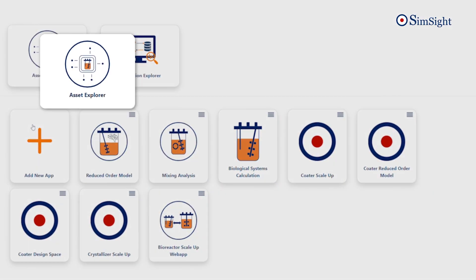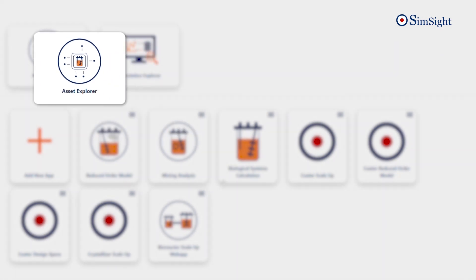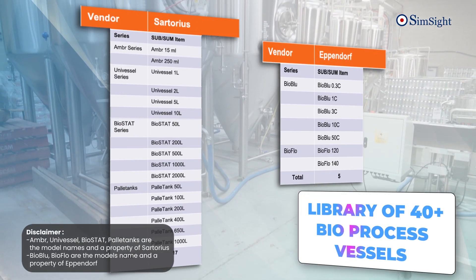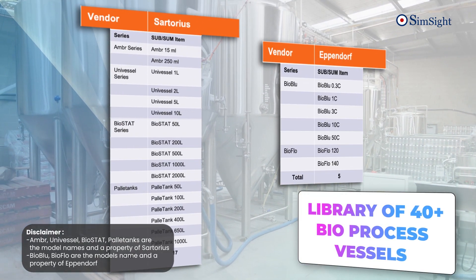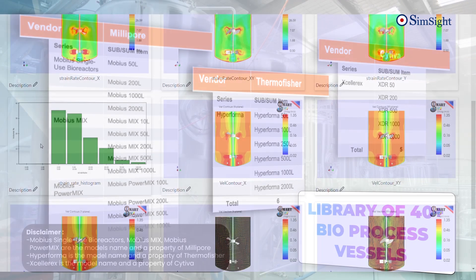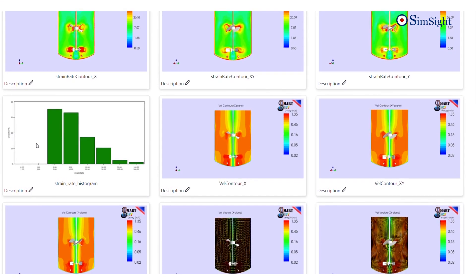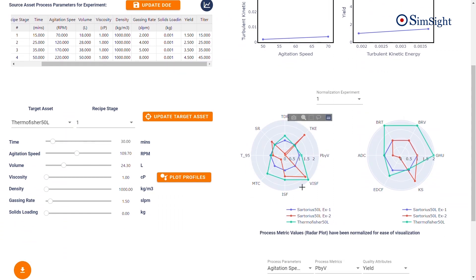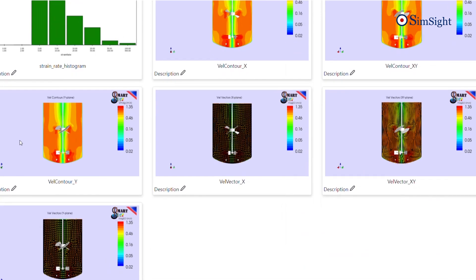Starting with the Asset Explorer, SimSight has several functionalities. This sophisticated application lets you see and examine process data and metrics in real-time for useful insights. SimSight has a library of more than 40 pre-analyzed single-use bioprocess vessels with a highly intuitive user interface that lets you explore multiple scenarios, optimize process parameters, and obtain deep insights.